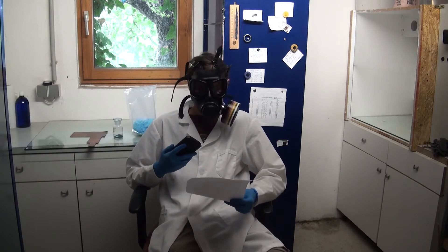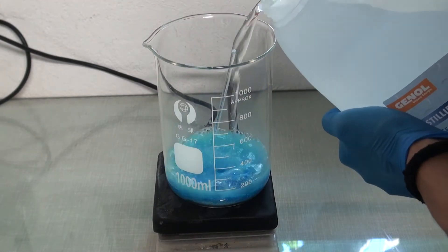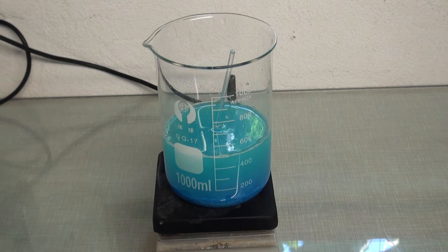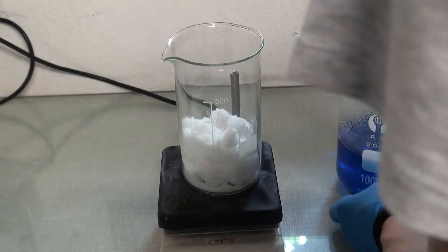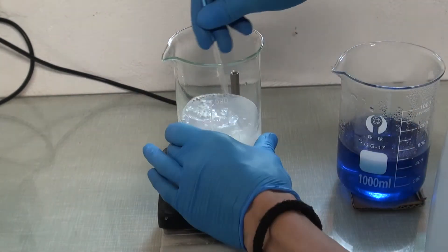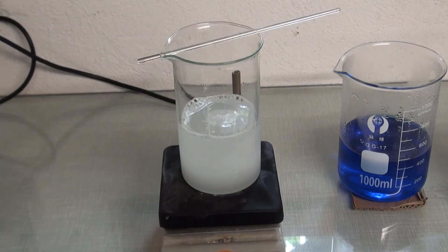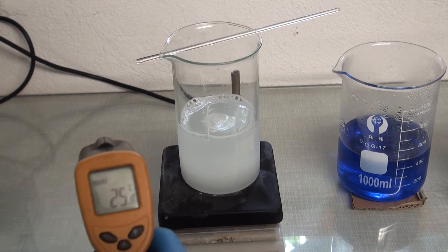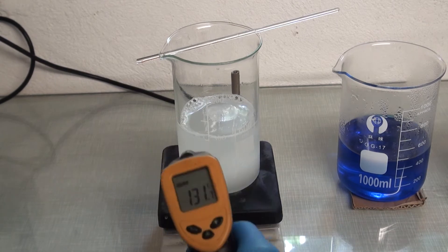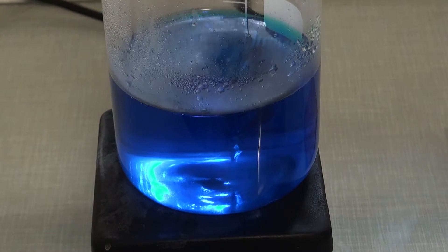I started by dissolving copper sulfate in water. Next I dissolved sodium carbonate in water and heated it. This was necessary because dissolving it is endothermic. This solution was then added into the copper sulfate solution.